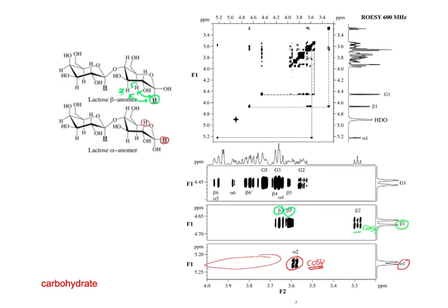And then for the galactose, so here's G1, which is the same in both. This should also show NOE. Yeah, so let's see what else they show. This one seems to be showing.